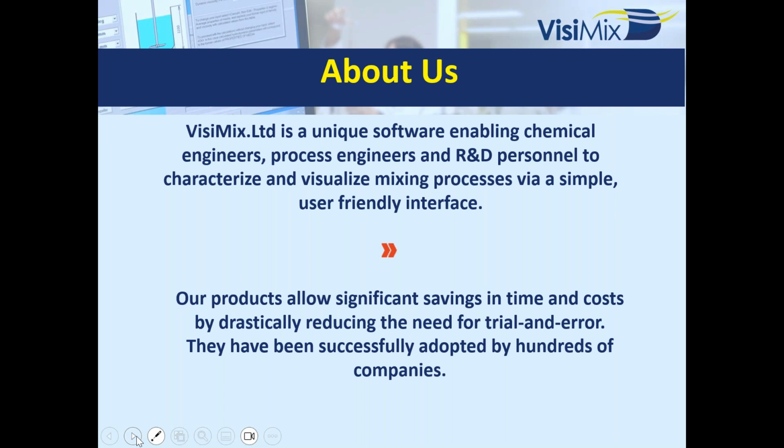And those parameters normally will control the operation that we are looking for. That can be a distribution of solids, mass transfer coefficient, gas holdup, and the news is that we will be able to upload many reactions, reversible, non-reversible reactions, catalytic reactions, and calculate what will happen with my process in the complexity of mixing we are generating in our tank. This is the news that we are applying.